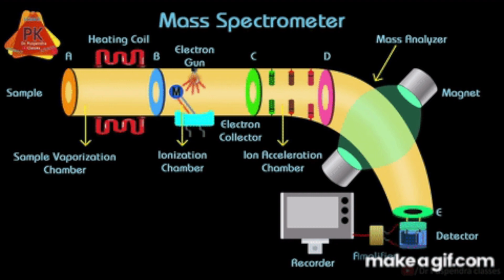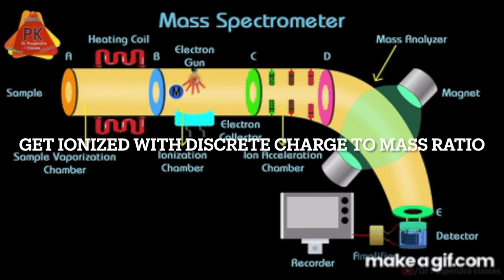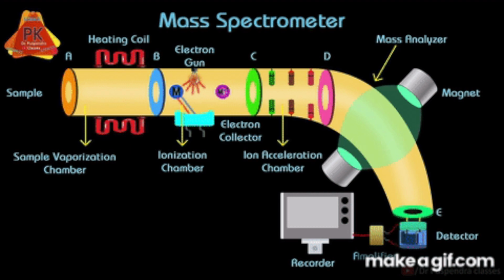But what you're trying to do is basically create a specific amount of charge per mass, so that you're trying to create a charged protein, because then you can use an electric field to accelerate that protein so that it goes really fast, right? So what is the point of accelerating the protein in an electric field? It is so that you can then use a magnetic field to bend it, which you're seeing here in the magnet, the green light looking thing.